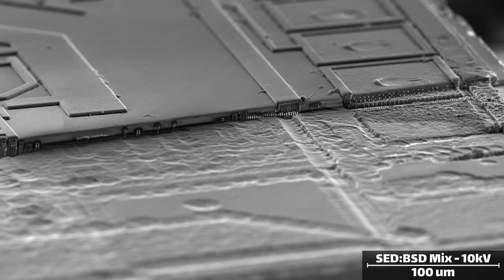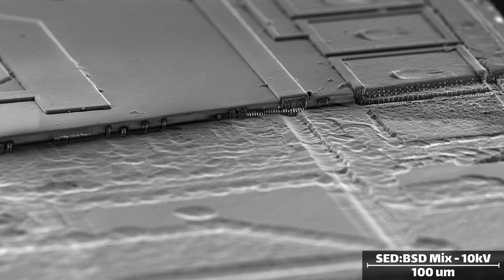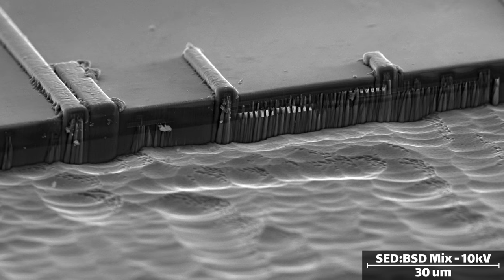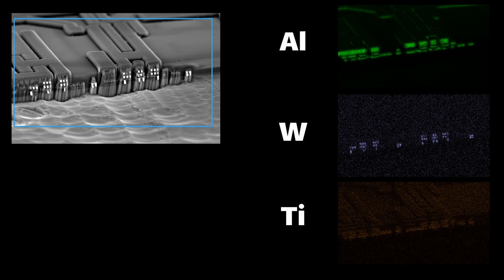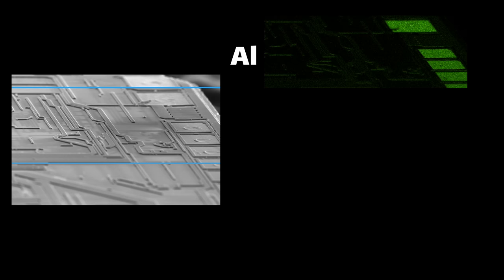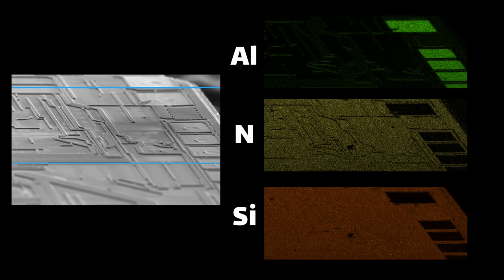If we go back to the cross section, we can get a glimpse inside the chip itself. And this is actually one of the main uses of ion milling, is to create nice clean cross sections for microscopy. The element detector shows us aluminum interconnects, tungsten vias, thin films of titanium used as adhesion layers, and a layer of nitrogen on top. At first I thought the nitrogen was just contamination, but if we look around the top of the chip, we can see nitrogen everywhere except the bonding pads. So I'm pretty sure this is actually a silicon nitride passivation layer applied to the top of the chip, which is pretty cool to see.